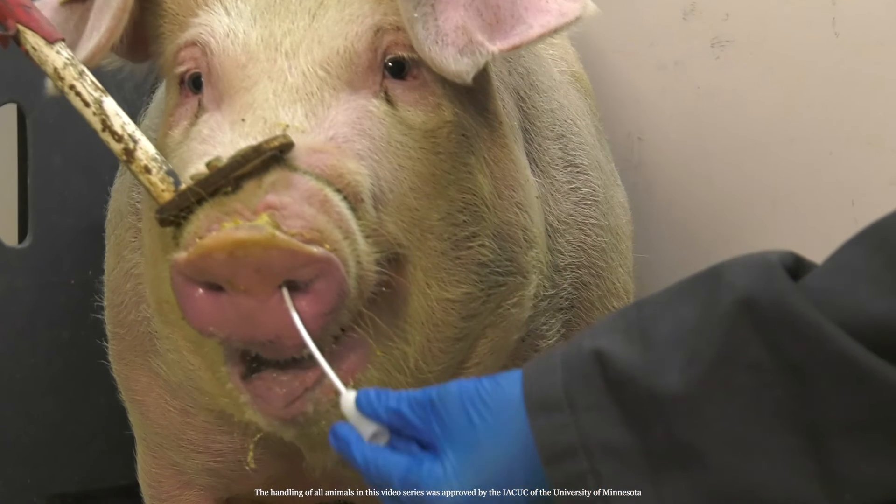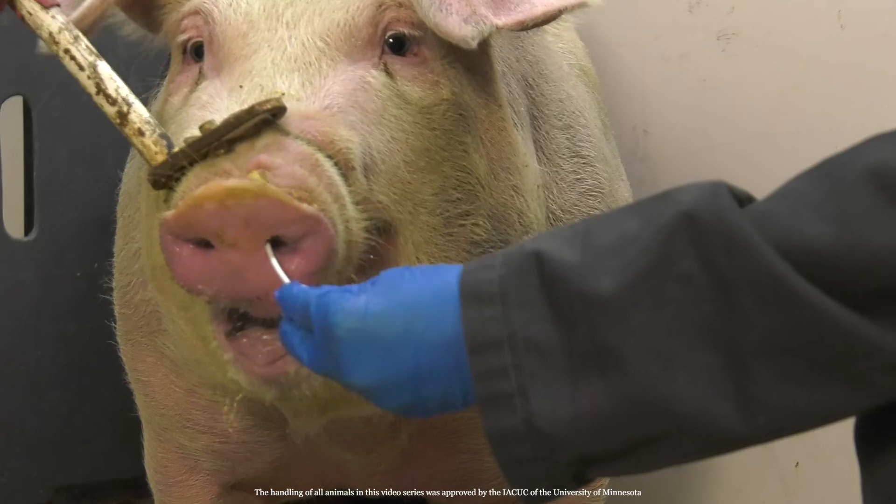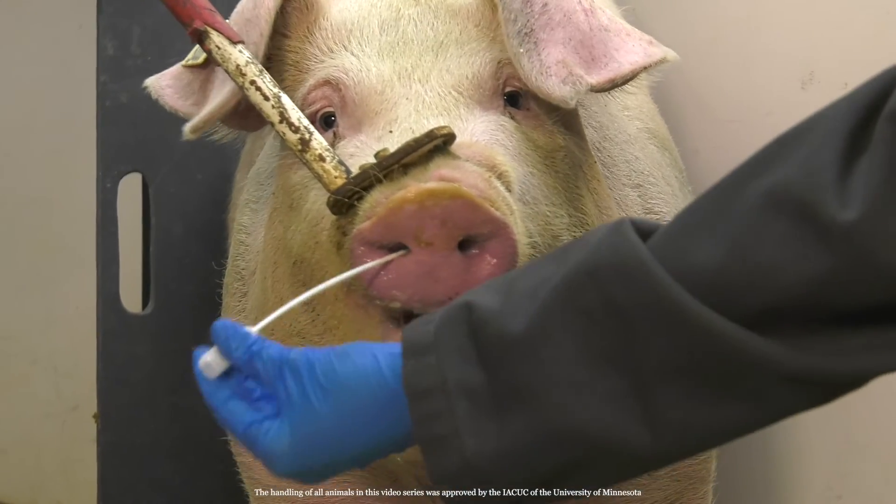Run the swab around the perimeter of the nasal cavity two to three times clockwise and then counterclockwise. Repeat in the other nostril. Make sure the swab looks wet.